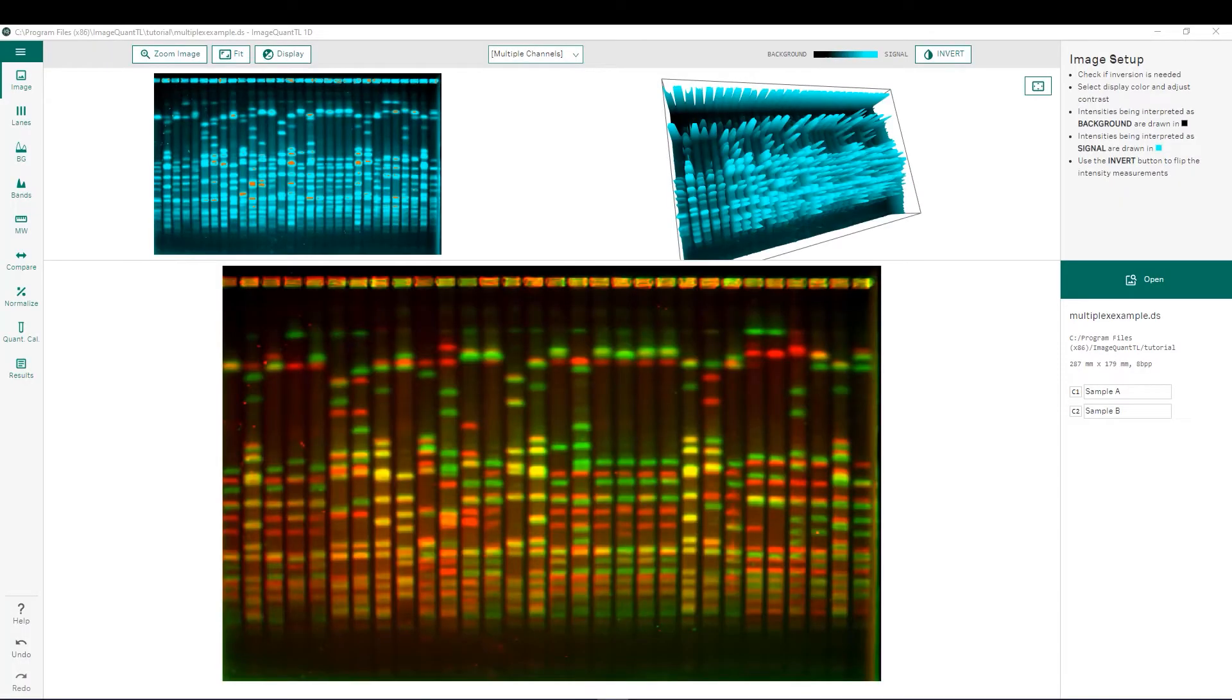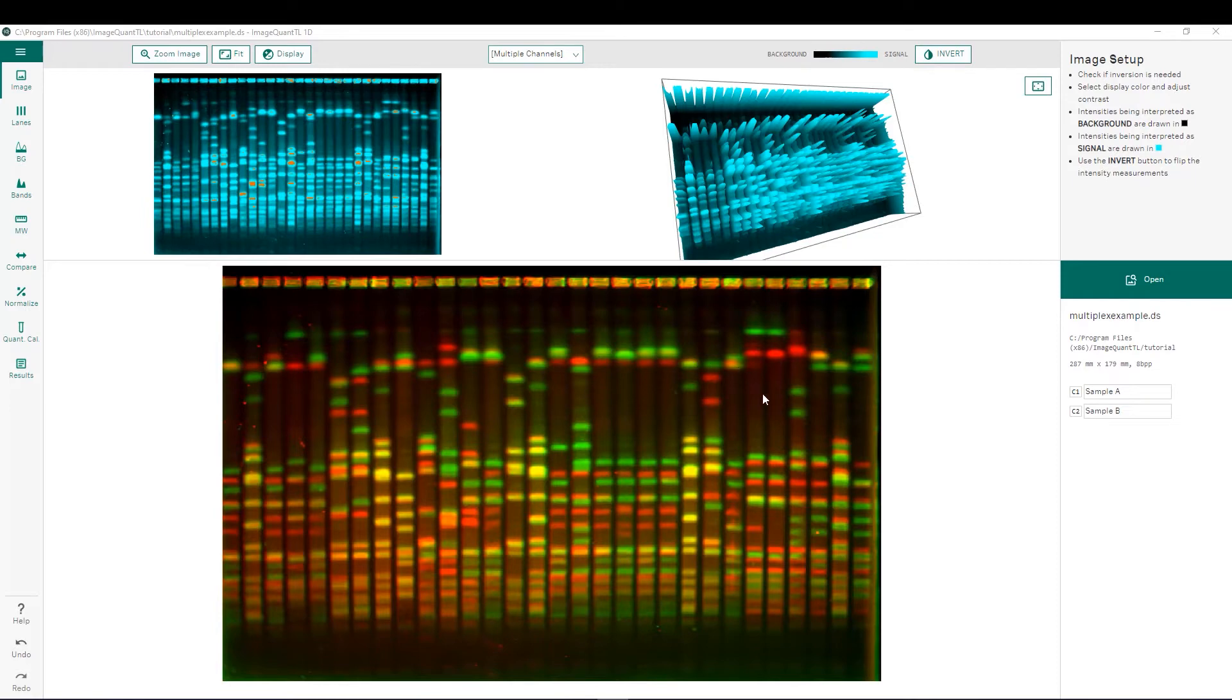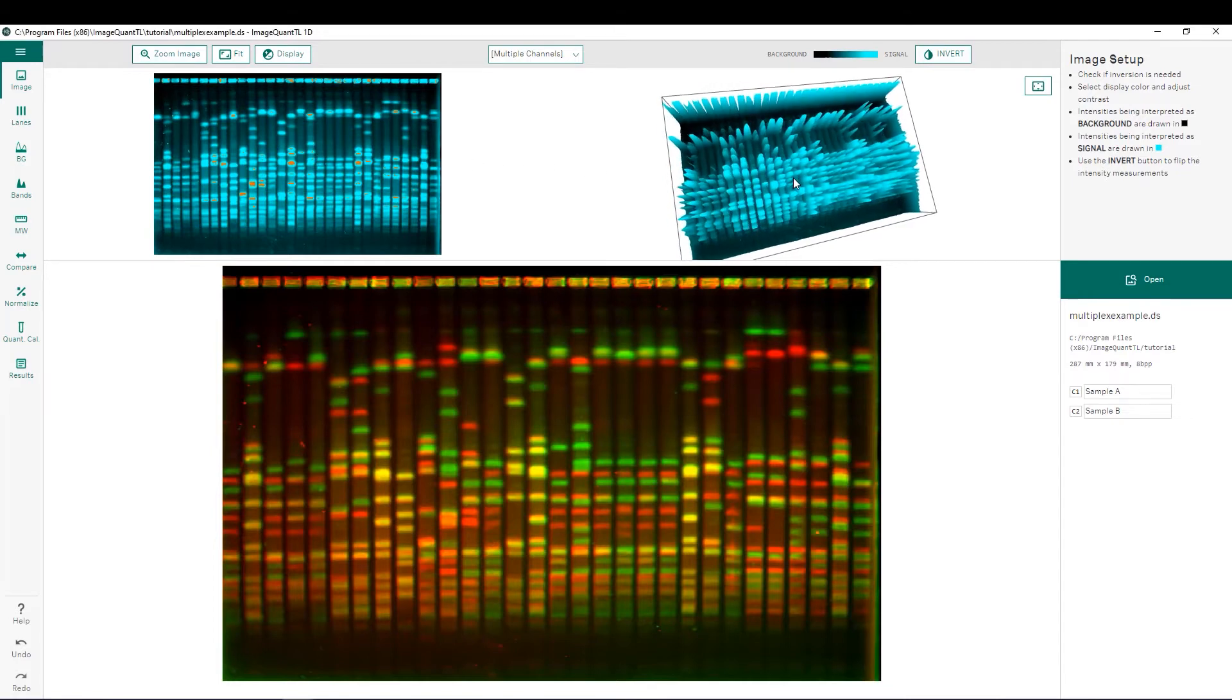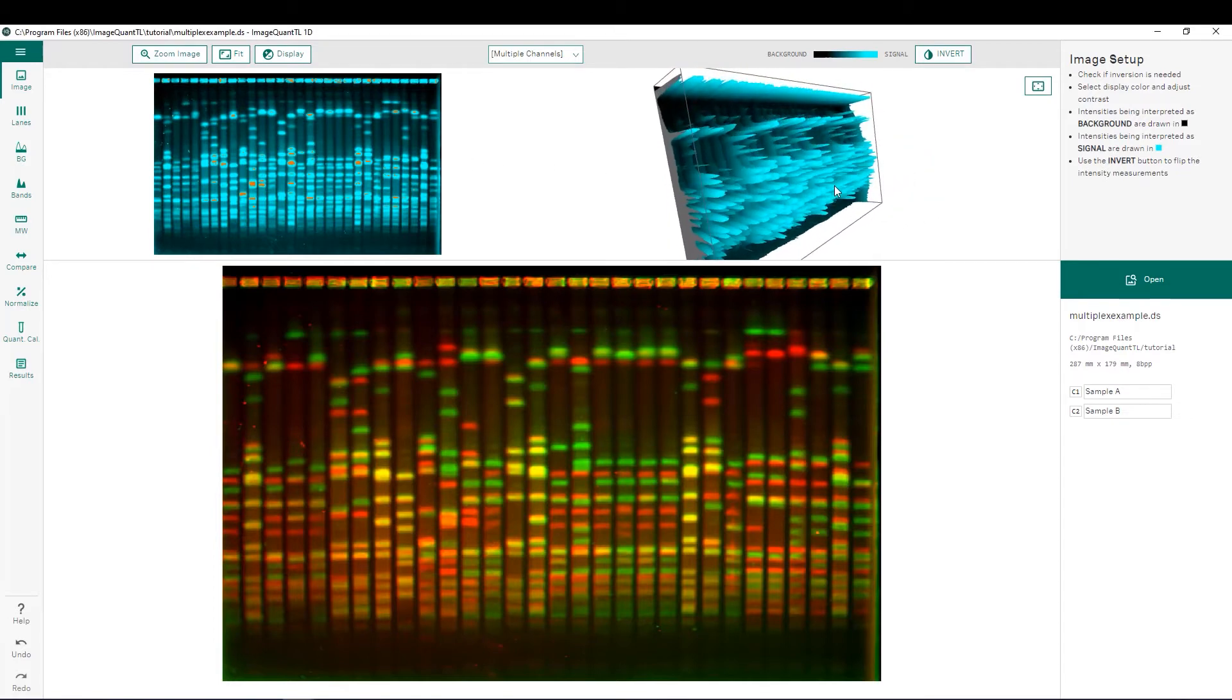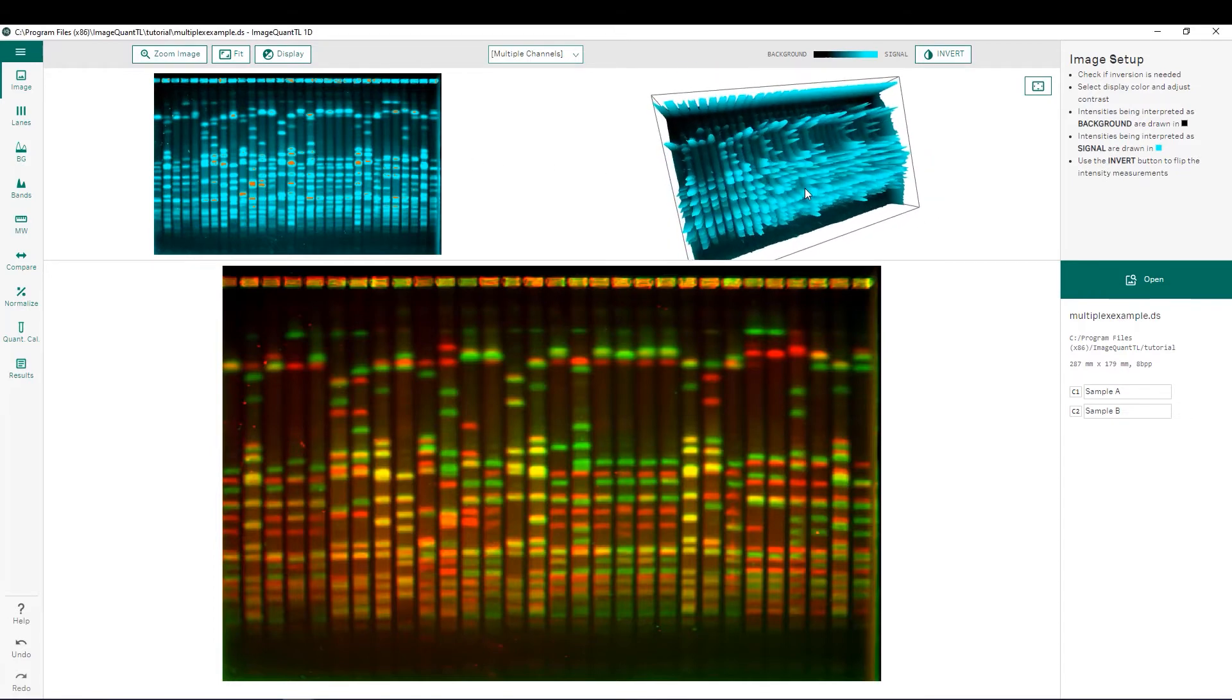This is the main user interface that is seen in the 1D GEL and BLOT analysis module after importing your image. Front and center we have our image to be analyzed as well as a 2D rendering showing any saturation that we have as well as a 3D rendering which can be rotated to any orientation that the user would like.